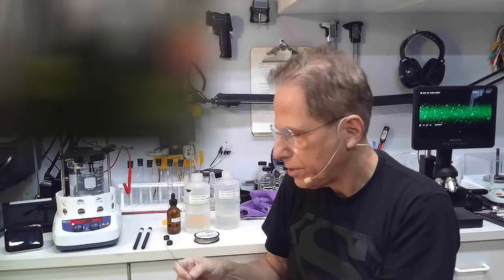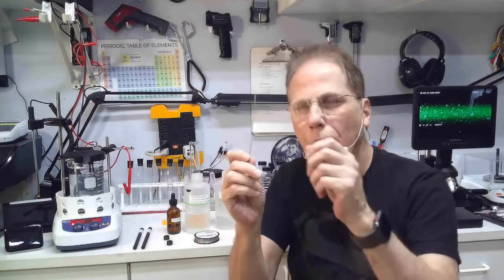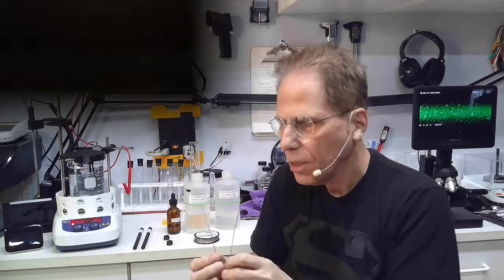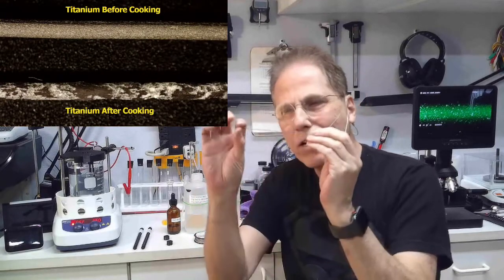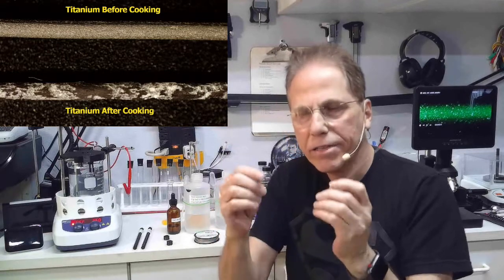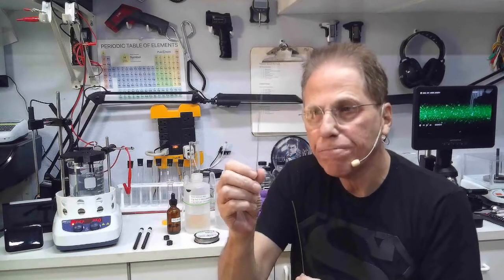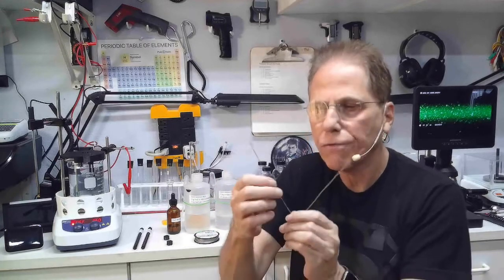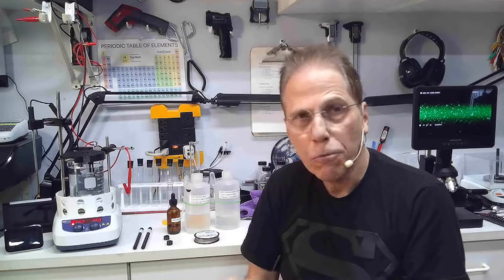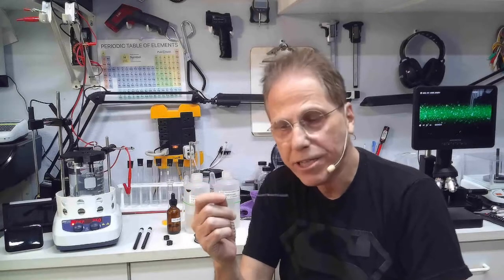There are two pieces of titanium here — one never used, and one I've used to cook this batch. After cooking, it looks like a battle zone — it gets all oxidized. I've tried to sand it off and it doesn't work. You'll get maybe three or four uses out of a titanium rod before it breaks apart and gets brittle from oxidation. In the lab they recommend sandblasting it clean.